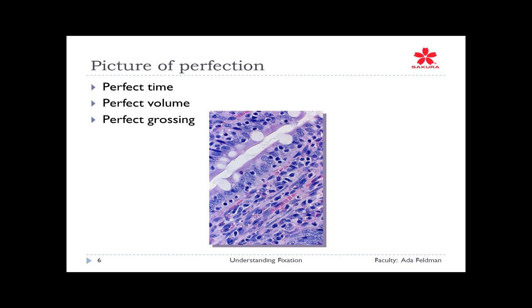We know how important that is, all right? And you can see, obtain a specimen that you've got right here. This is a section of colon. You can see the epithelial cells, where there actually are 2 types of nuclei that you should be able to see. You should see the nuclei that are known as open, all right, where you can see the nuclear membranes, the chromatin inside. And then we also have nuclei that are compact, that are very dark staining, all right? Both of those are normal nuclei that you can see there.